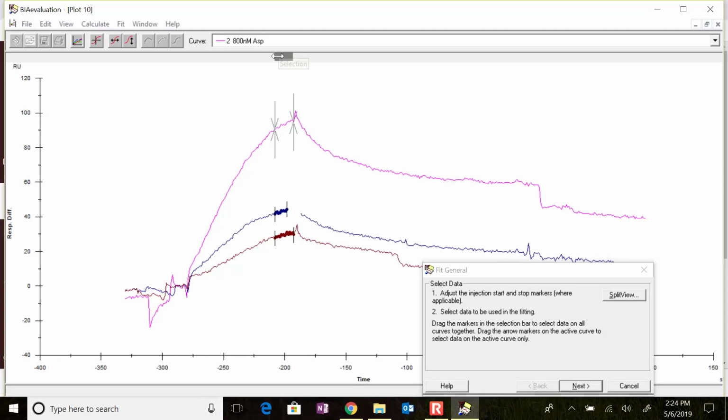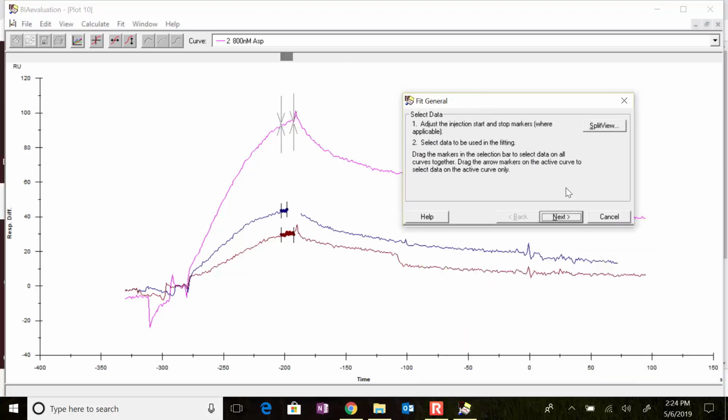These should be mostly flat lines, and in fact, you see how it's curving? Just a little much for my taste. A little bit of curve is okay, but you want to minimize the curve. You want to get it as flat as possible, so I cut off that end to get this little stretch, and we have 3 levels that are sort of flat-ish, okay? Those are my areas where it's closest to equilibrium.